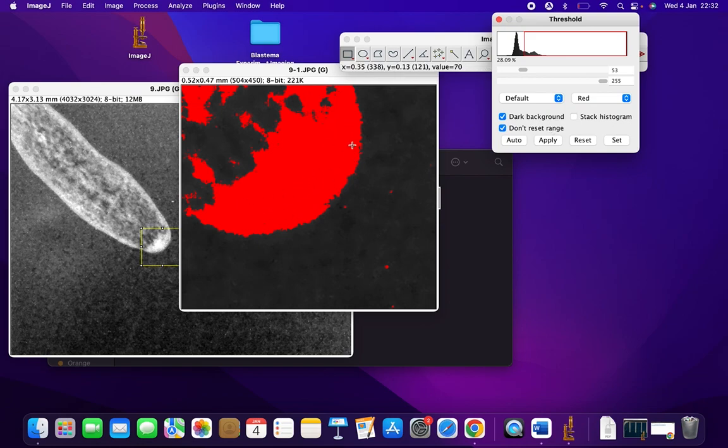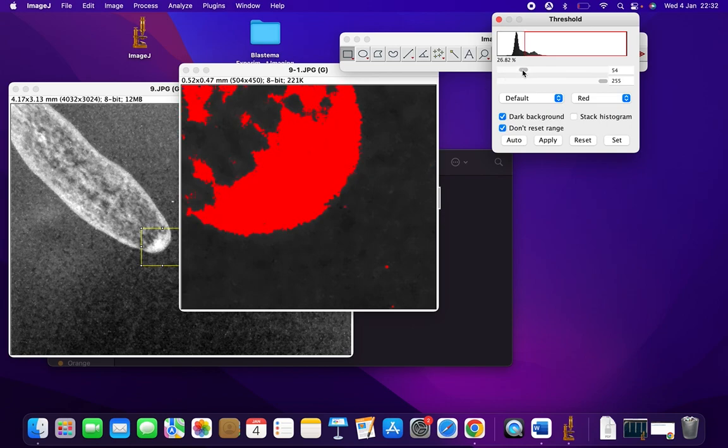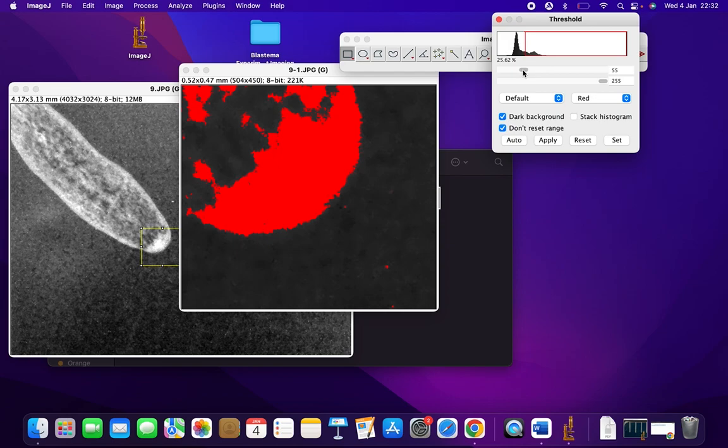We are going to adjust the scale using this bar and make sure that maximum of the blastema is red in color, as seen in this image. And then click on Apply.